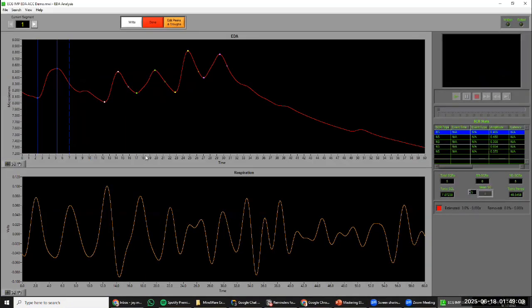Okay, so anyways, as far as looking at this data, what we would do about it, the waveform, the actual morphology of what this should look like is just like this. So there's going to be variance for every participant in the study you're looking at. However, in most cases it should be slow rolling hills, a very smooth structure like what we're seeing here.